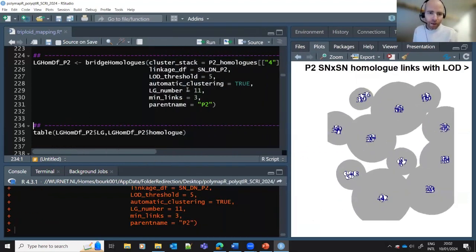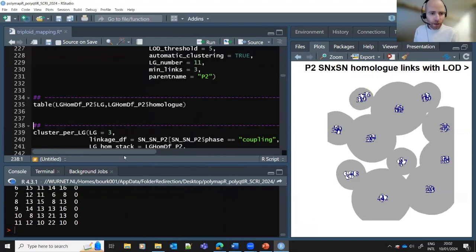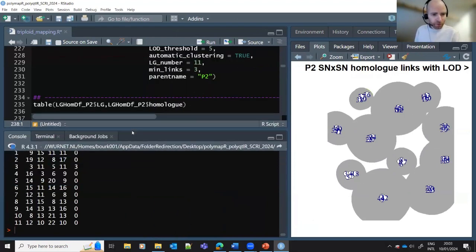Okay. Again, I presented these sorts of functions in the past as well in more detail. So if I'm going a little bit quickly here, it's deliberate. It's because you've seen this already. Or at least I hope you have.